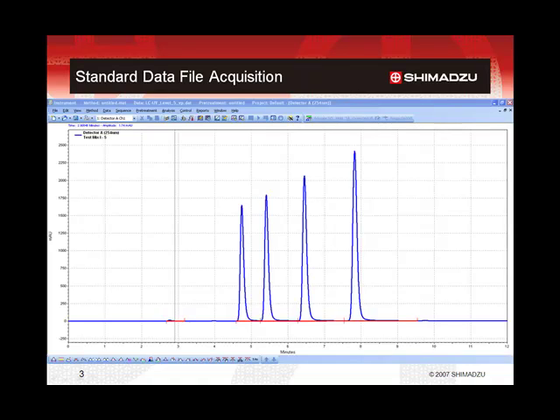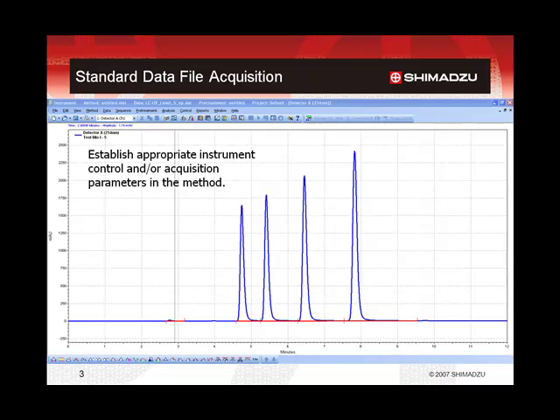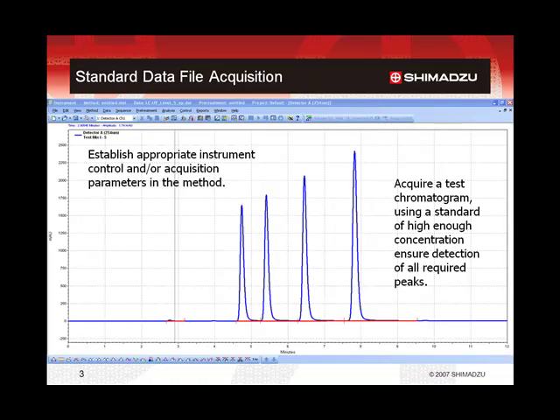Once the method has had appropriate instrument control and/or acquisition parameters established, the method can be used to acquire a test chromatogram. This test chromatogram should be from a standard mixture that contains all the analytes of quantitative interest. It should be at sufficient concentration to ensure detection of all required peaks, and should also be representative of the concentration range that will be used for calibration throughout the method.